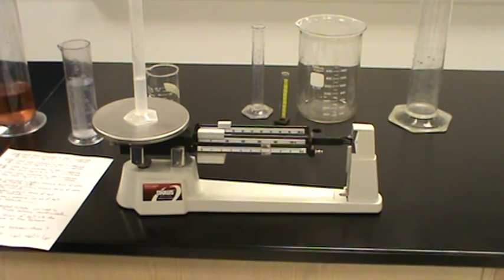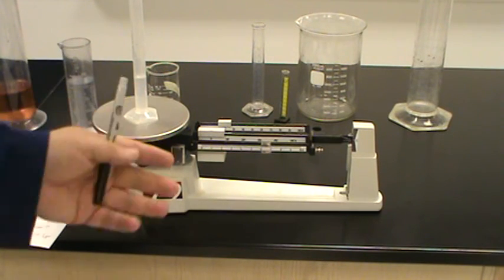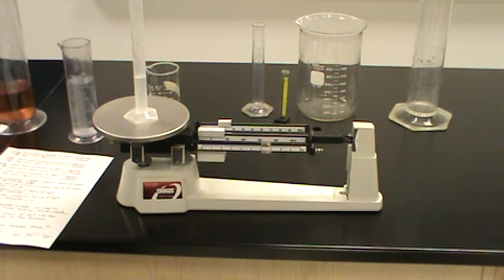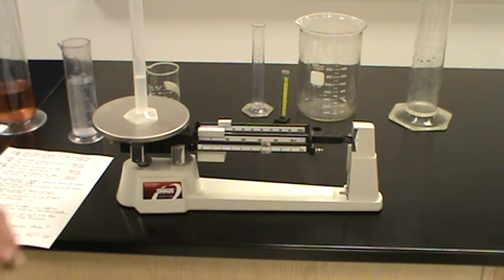Ladies and gentlemen, science is not always exact. Science doesn't always come out exactly the way you want it to the first time. If I were to run this experiment 5 times and then average it out, I could probably get much closer to my desired goal. But for this simple video right here, we have once again proven that 1 milliliter of water equals 1 gram.